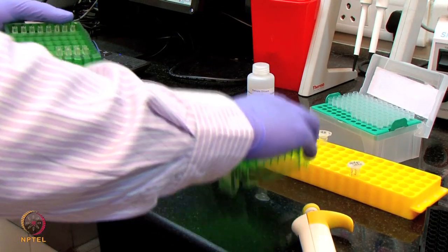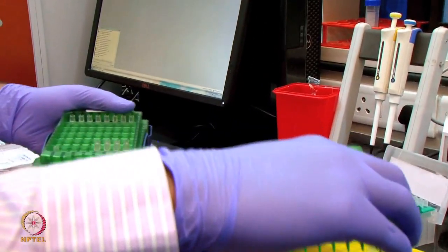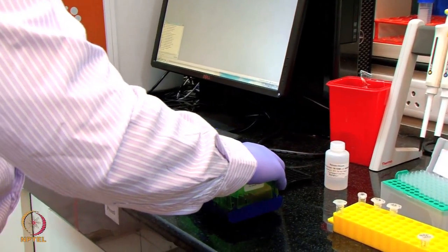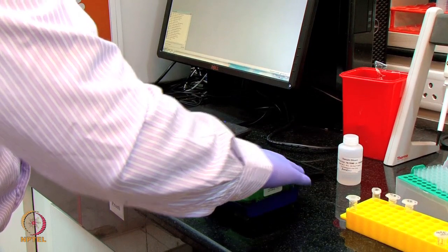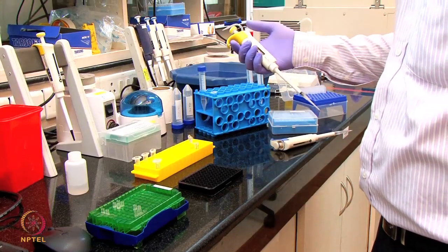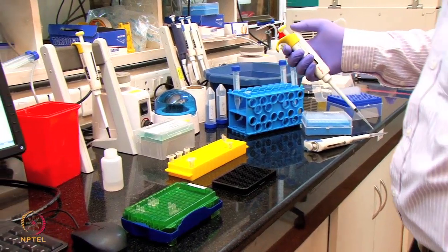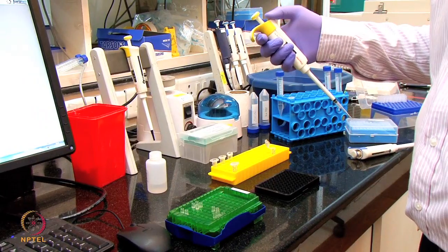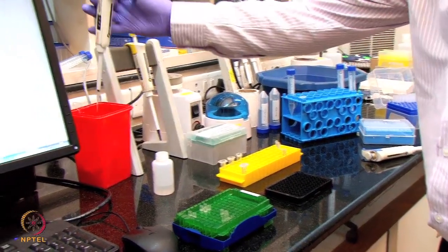Now I am keeping this sensor tray for hydration for 10 minutes. So I will set these sensors aside for 10 minutes. Now I am going to demonstrate how we immobilize the anti-apolipoprotein onto the streptavidin sensor.